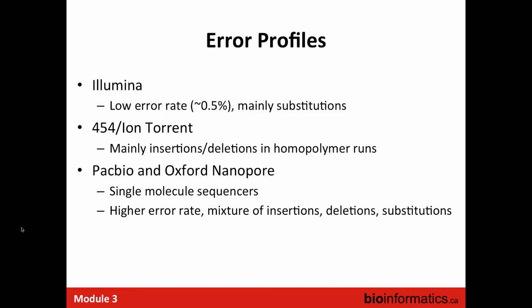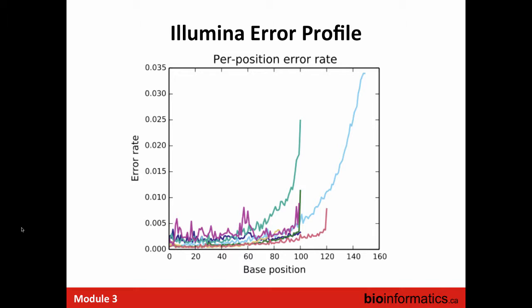So if that's the case, then in theory, if you had a shorter reaction, the error rate would be lower, and the longer the reaction goes, the higher it gets. Yeah, so you can see it in this one. The set of reads that's 150 bases in this case had the highest error rate, and for all of the longer ones, the error rate creeps up.